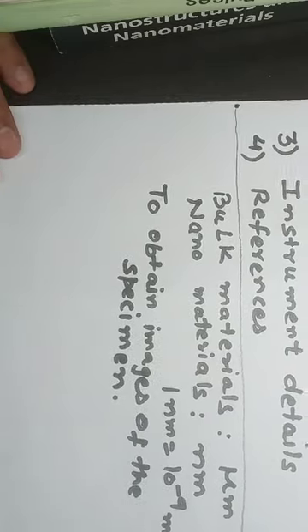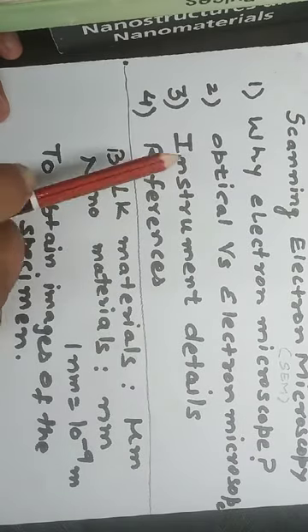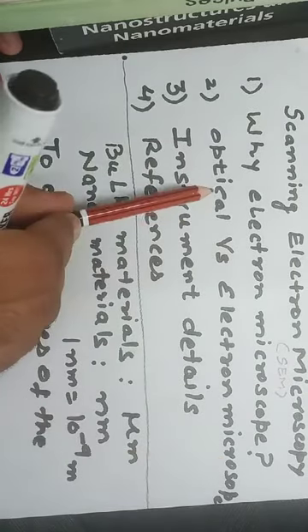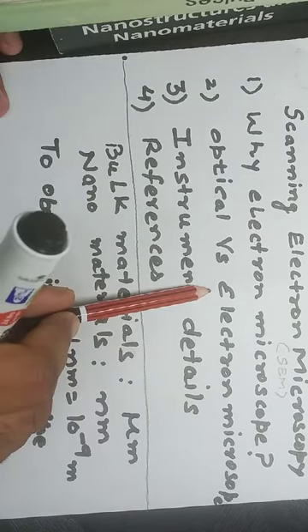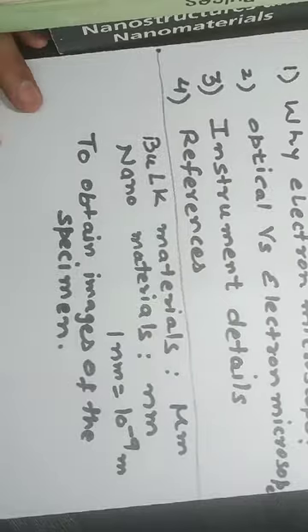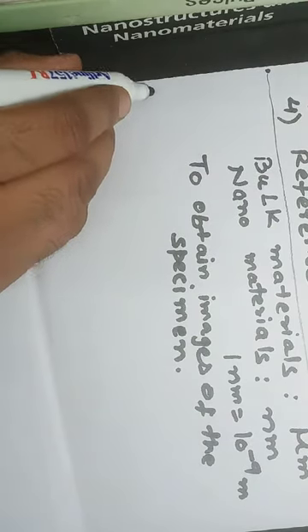Now the second question we have to answer is optical versus electron microscope. What was the problem with the optical microscope, that we need to introduce the electron microscope? That is the next question we would like to answer. So let's come to the second point.